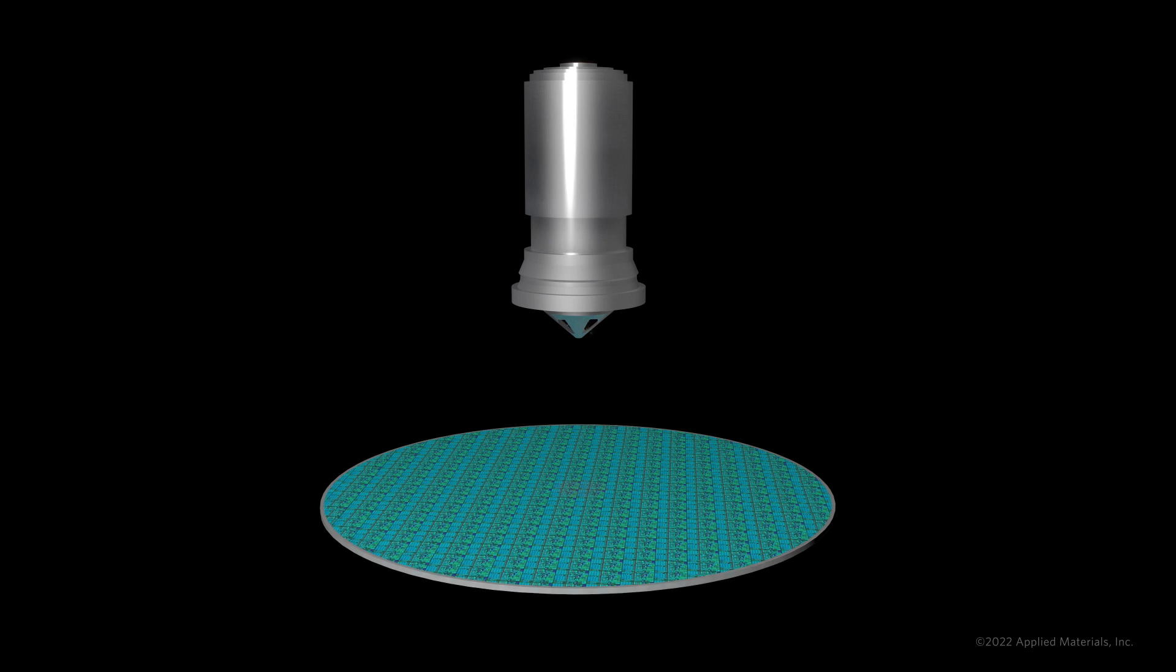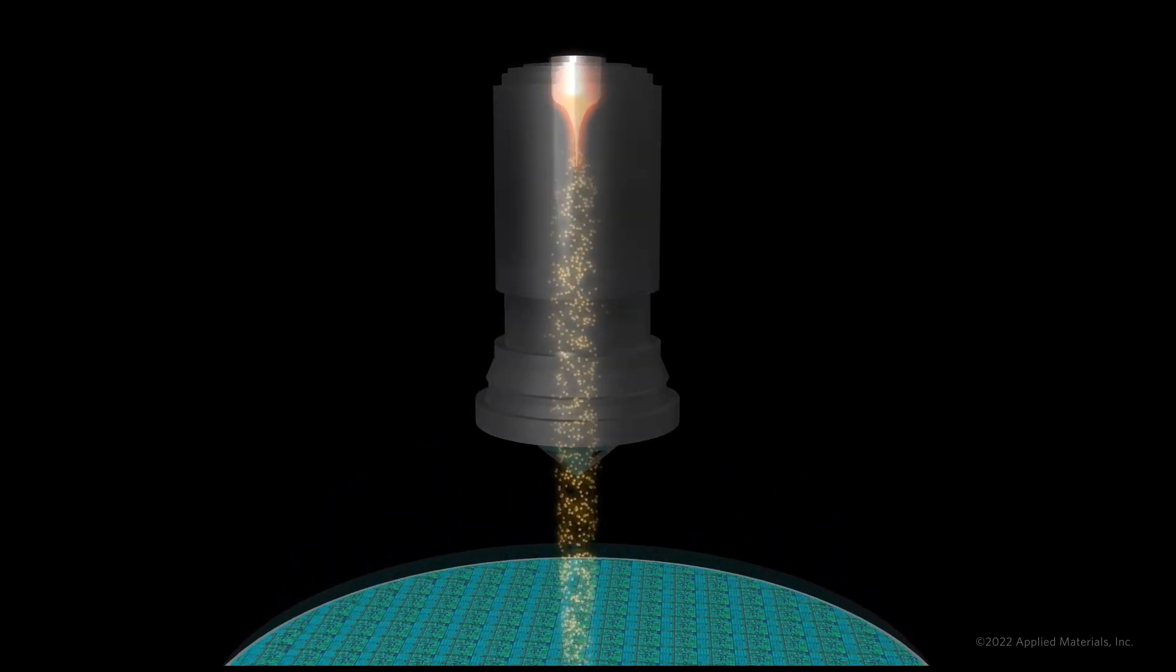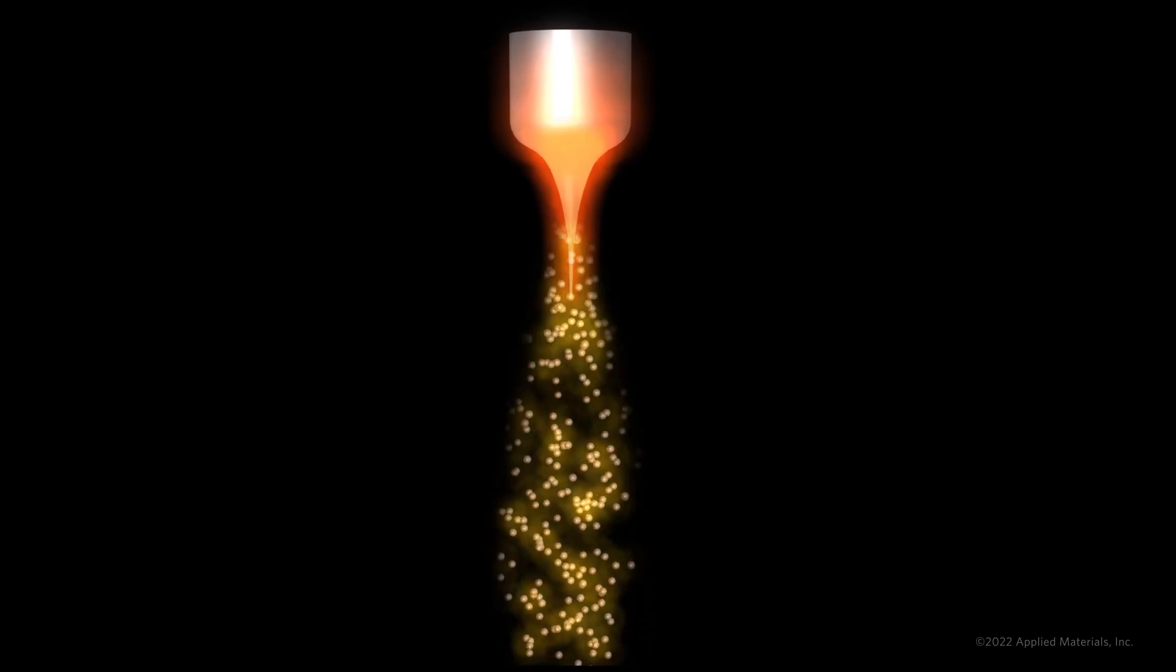We start by taking a closer look at the inside of the SEM column, where we will find a traditional TFE source at the top, emitting electrons at very high temperatures.